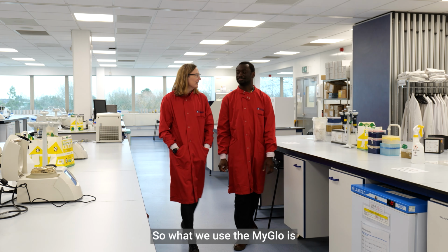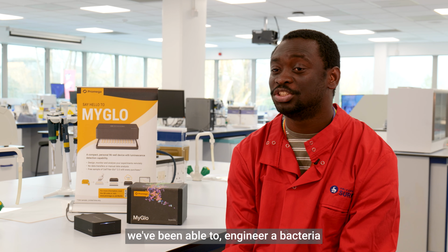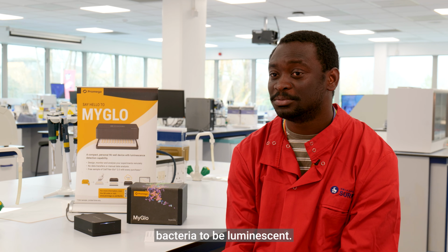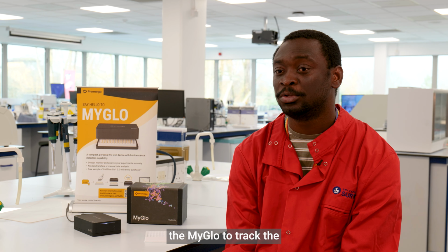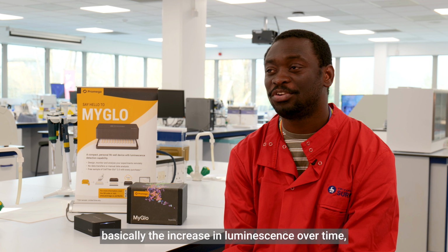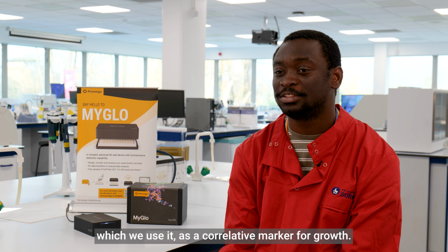So what we use the MyGlo for is we've been able to engineer bacteria to be luminescent. So what we do is we infect the macrophages with these luminescent bacteria. Then we can use the MyGlo to track basically the increase in luminescence over time, which we are using as a correlative marker for growth.